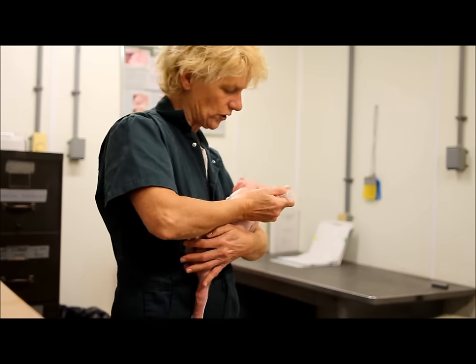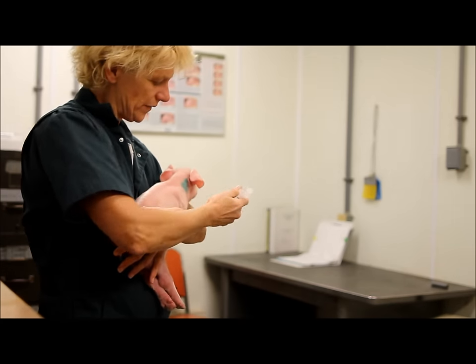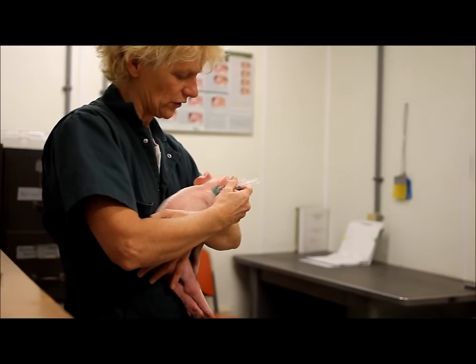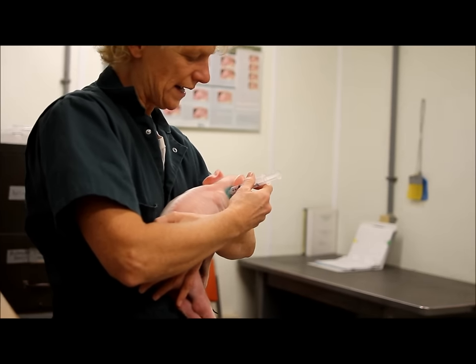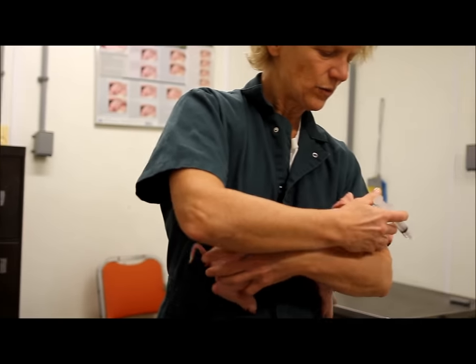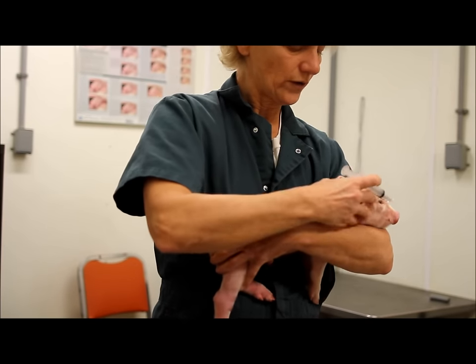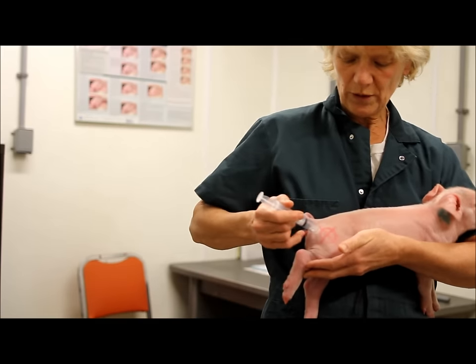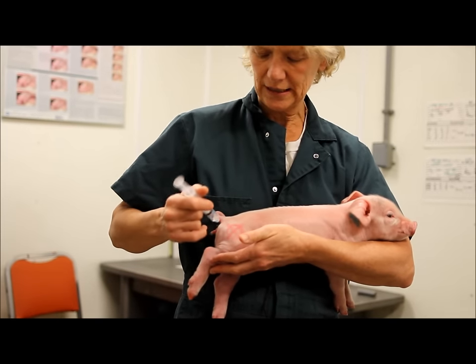We want to make sure that when we put the needle in, it's perpendicular or at right angles to the skin. We've picked the right needle for the right size of this pig.